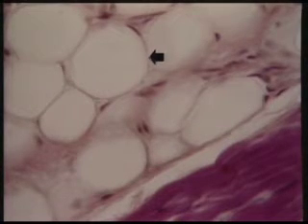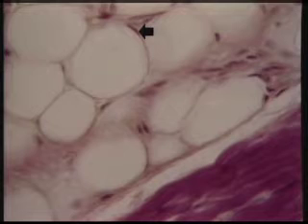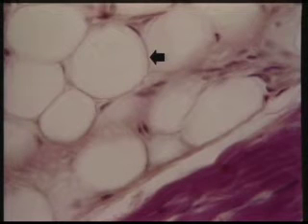The working parts of the cytoplasm have been reduced to this little area you see right here, and the nucleus has been squashed off to one side and just looks like a flat little crescent. So this is how fat cells look in the light microscope, and in this case the cytoplasm has basically replaced itself with its own accumulated product.